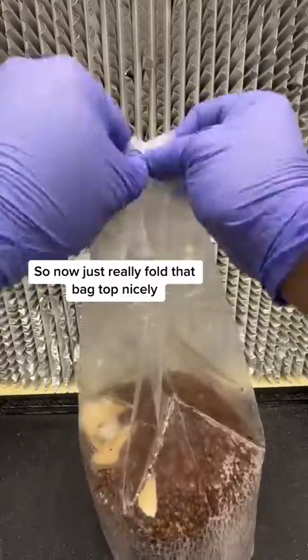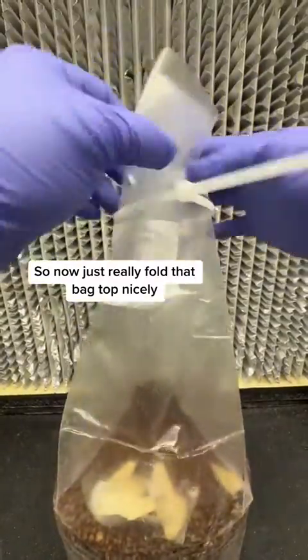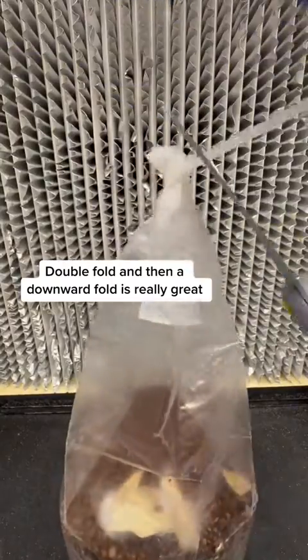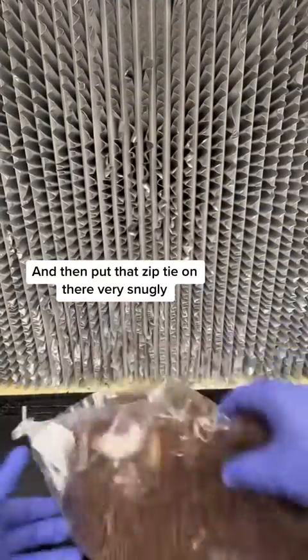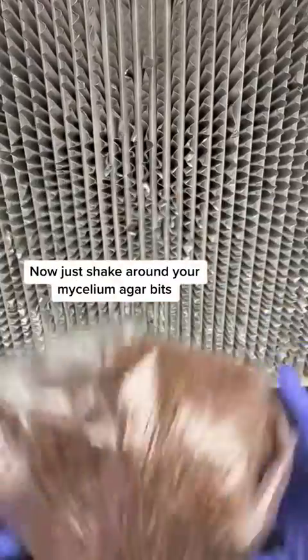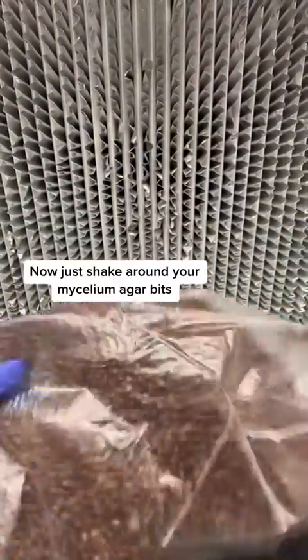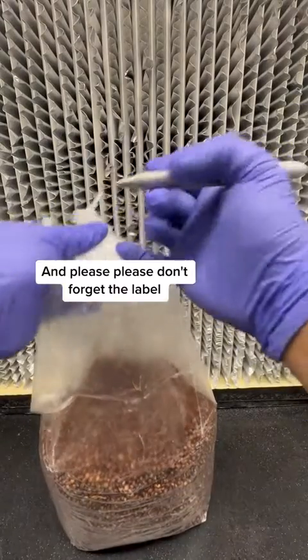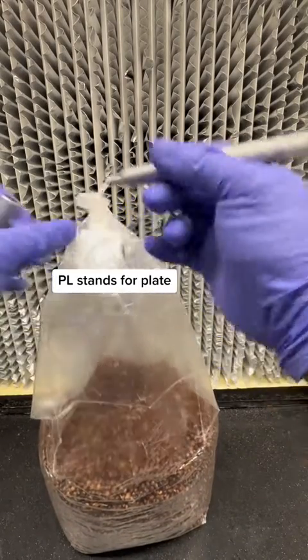Now just really fold that bag top nicely. A double fold and then a downward fold is really great, and then put that zip tie on there very snugly. Now just shake around your mycelium agar bits. Make sure that they're all kind of spread evenly, and please don't forget to label. PL stands for plate.